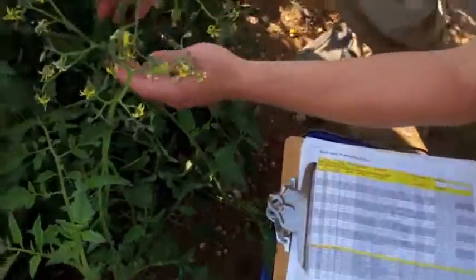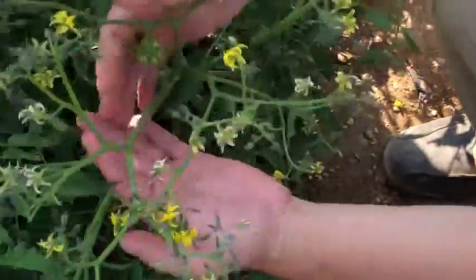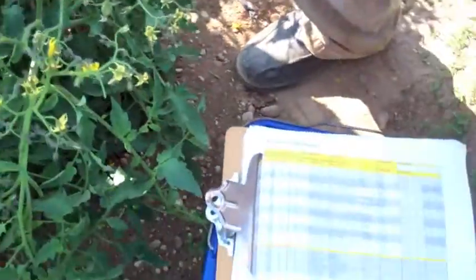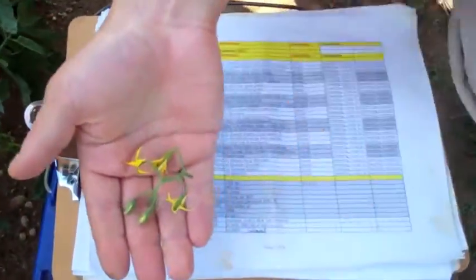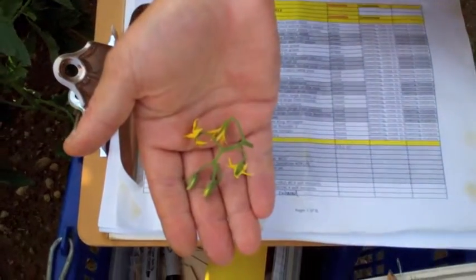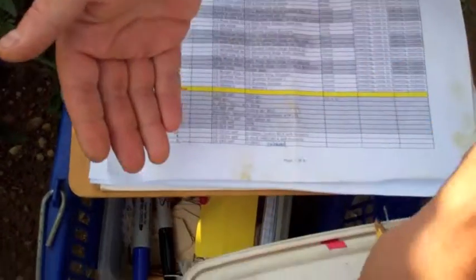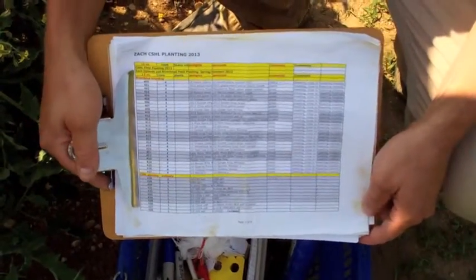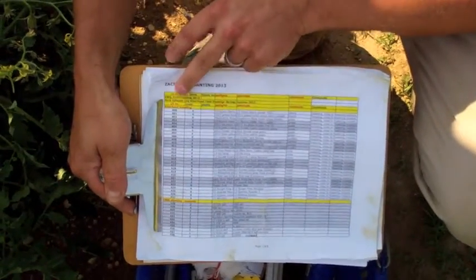When you do a cross, you first identify your mutant. Here you can see this is the branching mutant, and you're going to want to cross the branching mutant to your normal unbranched plant. You come to the field with your pedigree book, which has all your pedigree information and all the information about each plant.